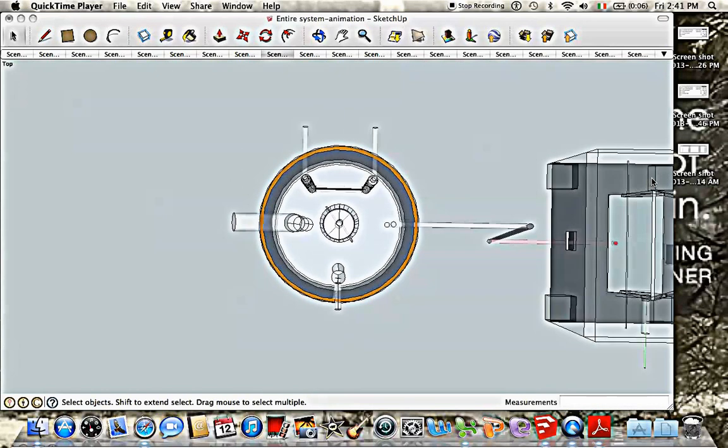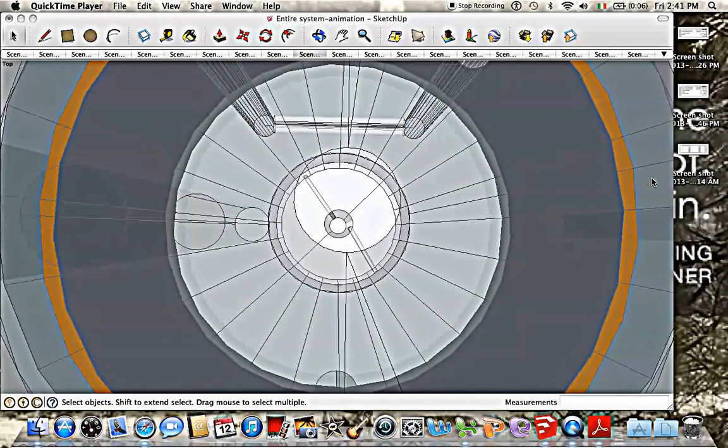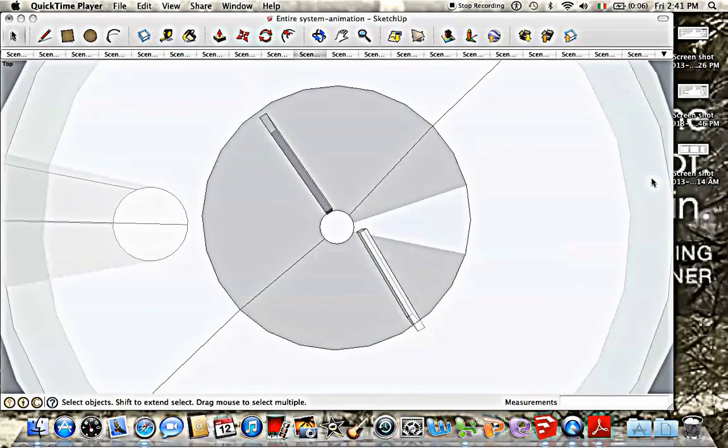As this is a continuous stirred tank reactor or CSTR, there is a motor with a shaft which propels paddles at the bottom, continuously stirring the organic material. In reality, there are 8 paddles. 2 paddles can be seen here.